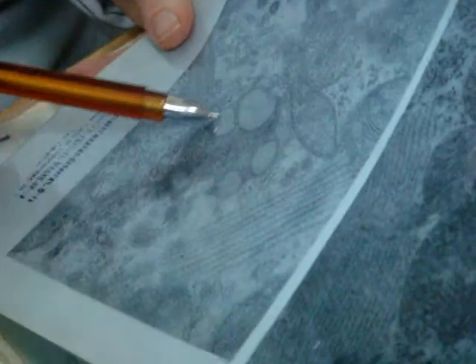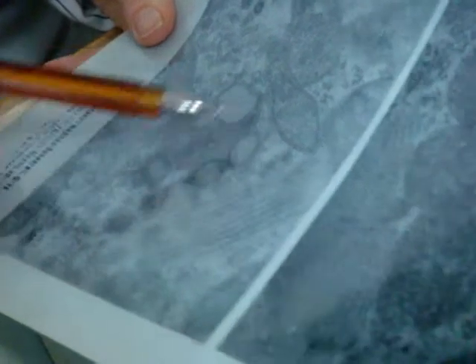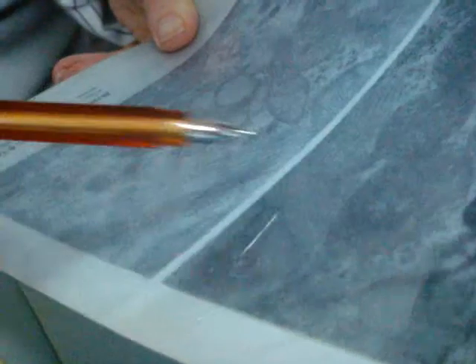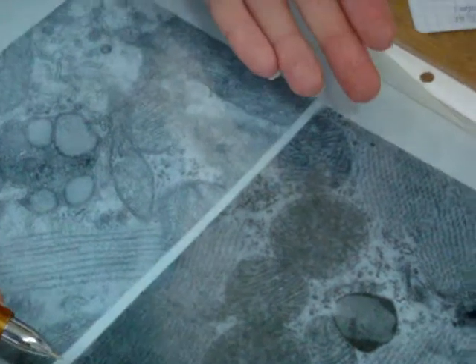Here also, look please, what this is: secondary lysosome, it consists of a lipid droplet I think and something else. All these are mitochondria, these are myofibrils, that's why this is also muscle tissue. We can't say whether it is cardiac or skeletal. No information.